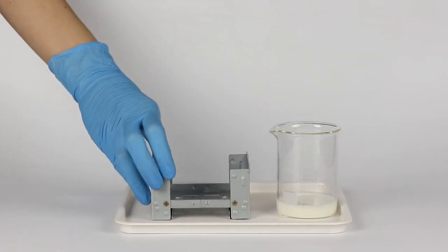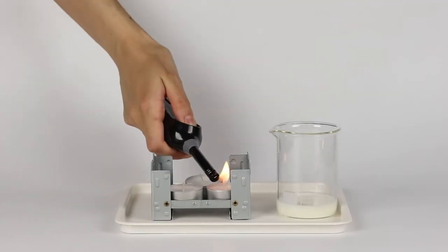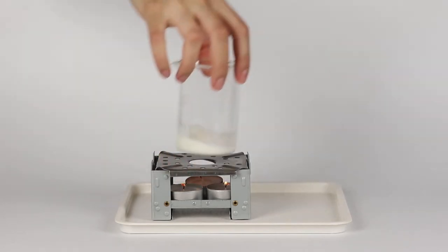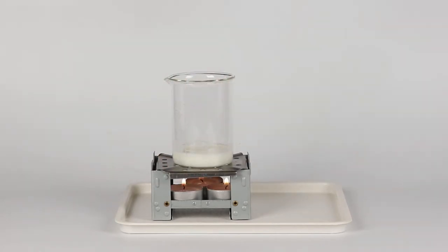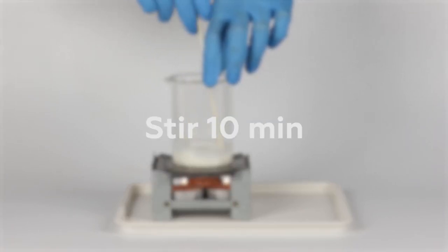Then put the three candles into the stove. Take off your protective gloves and light the candles. Cover the stove with the flame diffuser and place the beaker on top of it. Put your protective gloves back on and stir the mixture for 10 minutes using the wooden stick.